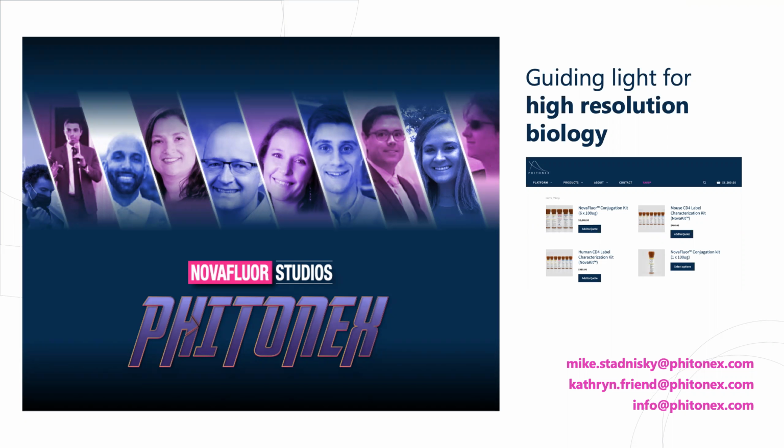Yeah, I was just wondering, because I think at the end you mentioned if there were any issues with the brilliant violets or the super brights. The problem is, I try to tell people to bring single stain cells for their controls, but if they don't have a very good positive population, like if the marker is really dim or it's a really rare population, then it can be challenging to bring single stain cells. So in that case, people tend to want to bring compensation beads as an alternative. But if there's a mismatch in the spectra for that particular antibody on compensation beads, then it becomes an issue with unmixing on the Aurora.